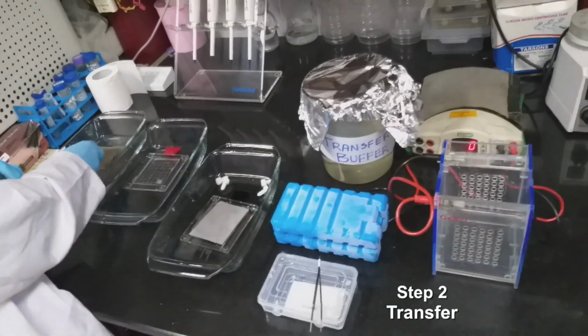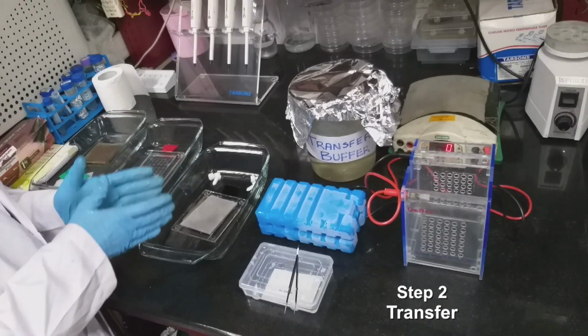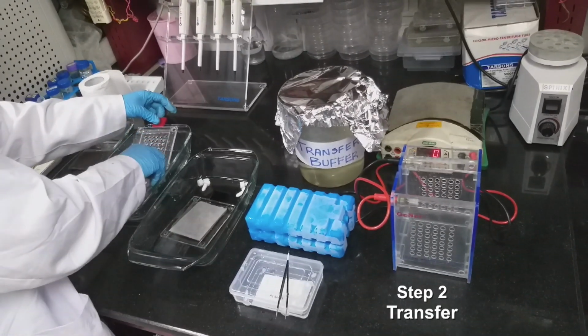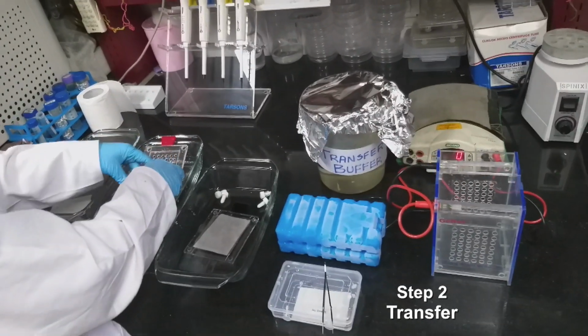Once you have inserted the blotting sheet, you have to keep your gel.